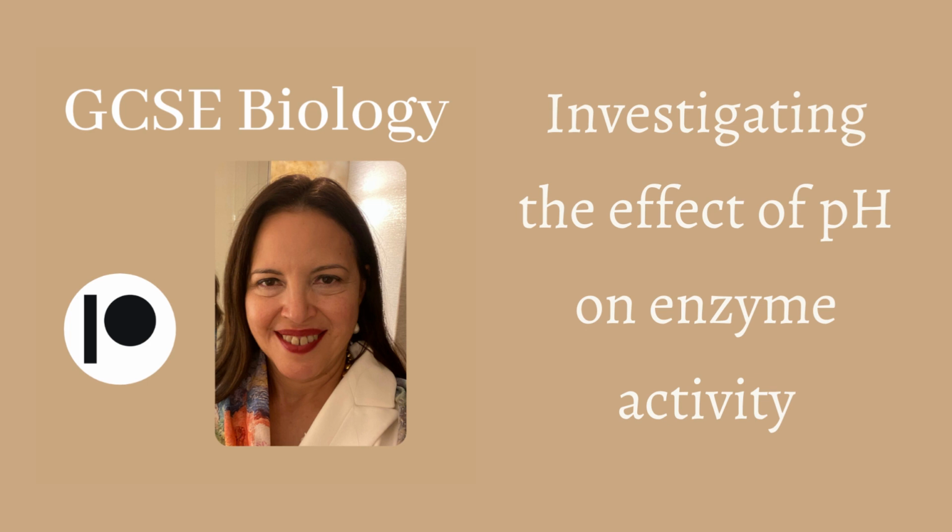Welcome to Lesson 4 Biology GCSE. Today we will be looking at how we can investigate the effect of pH on enzyme activity. This is required for both biology and combined science.